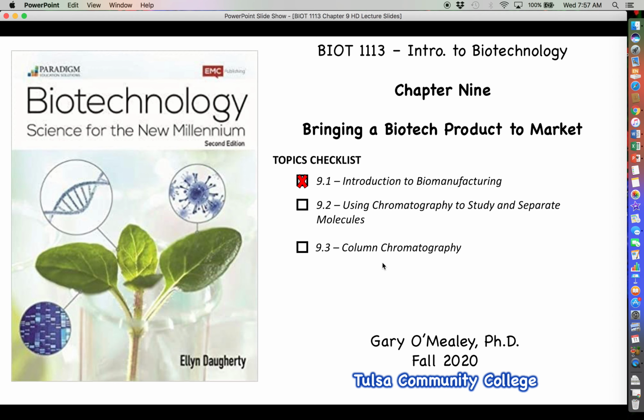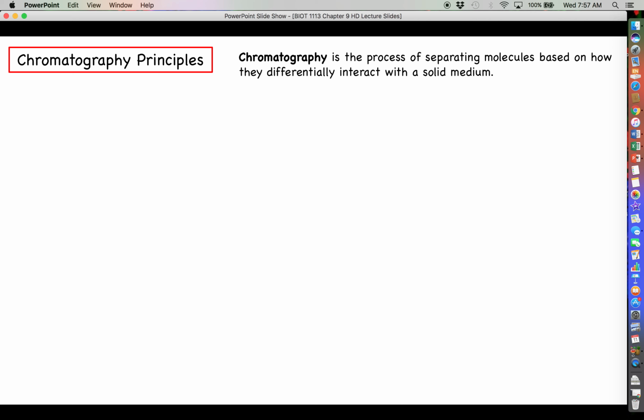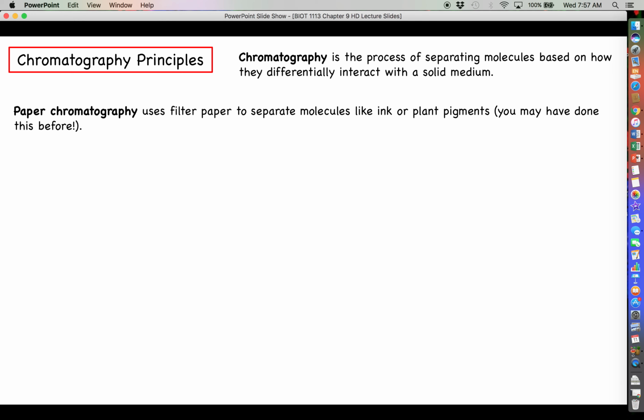So let's go ahead and start by introducing ourselves to the actual principles behind how chromatography works. First of all, what is chromatography? Well, chromatography doesn't necessarily have to do with just proteins, although it is certainly most commonly used to separate and purify proteins. Chromatography is just the process of separating molecules based on how they differentially interact with a solid medium. Basically, whatever your solid medium is, different kinds of molecules are going to interact with that medium in different ways, and chromatography takes advantage of that.